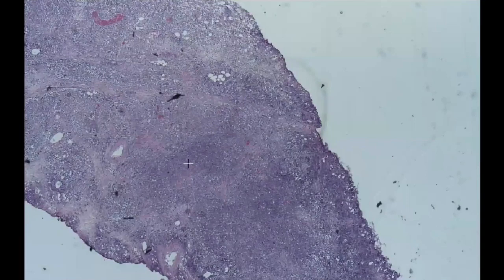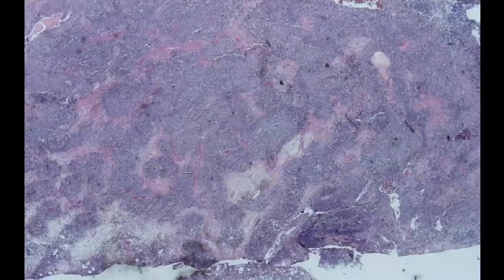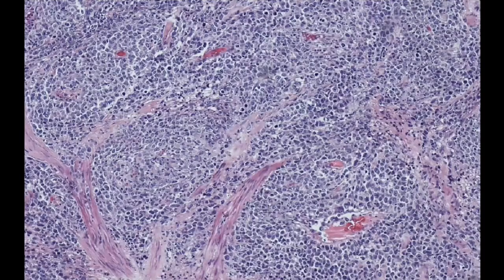At this low power, the cells don't look monomorphic — they don't look alike. We have different sizes among these cells. On higher power, I can see a lot of cells, and I can see a lot of apoptosis going on. Those small dots may be apoptotic bodies.